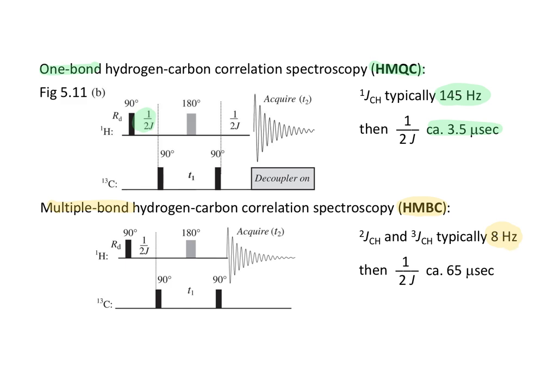This now leads to a relatively longer time between the pulse sequence for the hydrogen frequency and the carbon-13 pulse. This difference allows for the focus to be on the smaller coupling constants, ignoring one-bond hydrogen-carbon coupling constants.